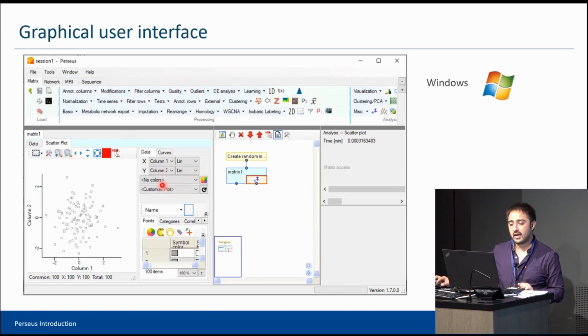And the workflow is actually dynamic, so it changes. By default, it has actually 3 windows. The window in the middle shows you exactly the workflow of the data. So let's say the data pipeline, the process you have done. It will start normally from loading the data. So you have a box with actions, and then you have an output, and then another action, and another output. So it will be like a chain. And then the complete workflow is represented here, and you can go back to a previous step and just click on it and visualize it.